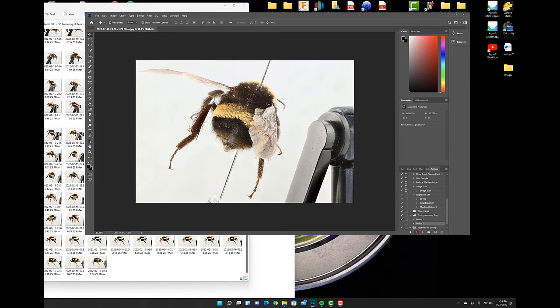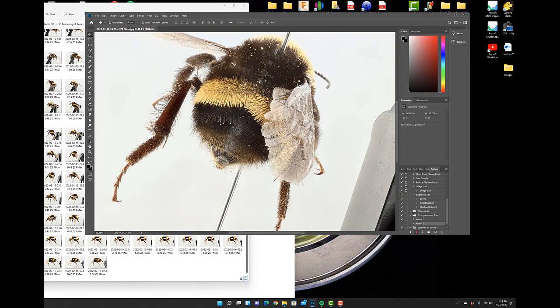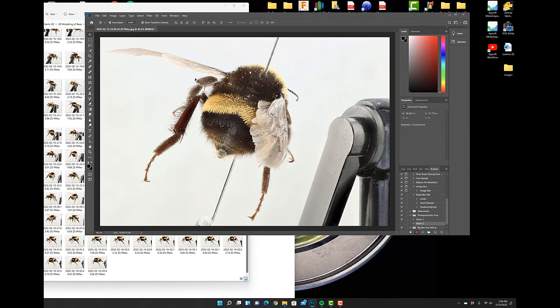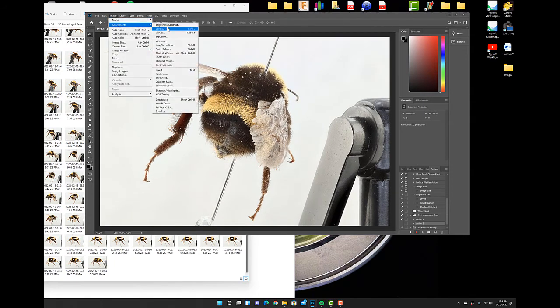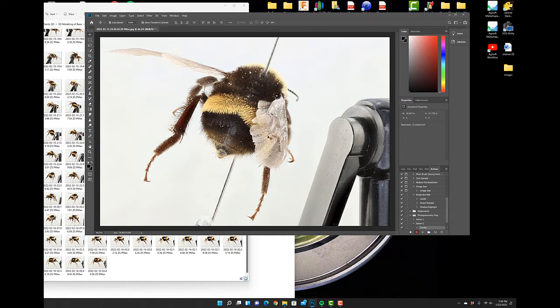Everything that we do to edit this is now going to be preserved. And as I said, the lighting here is actually just really phenomenal already from the simple output, but let's just say you wanted to improve the contrast slightly. I think for that, I might just use curves, just gently sort of darken the specimen and brighten the background just a tiny bit. So you can see I did that in such a marginal amount. I think, to be honest, that's all we want to do.